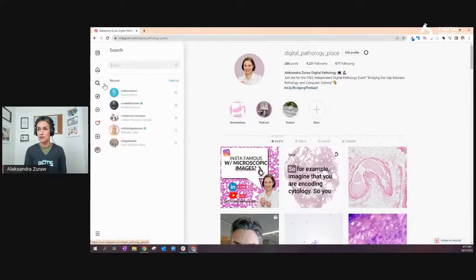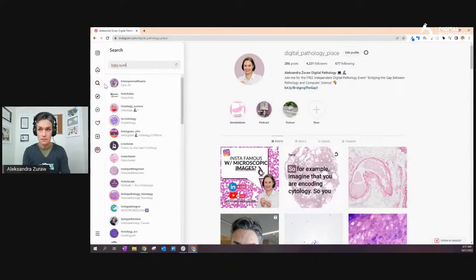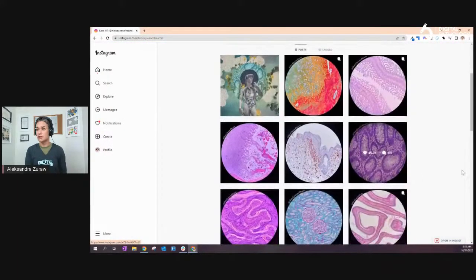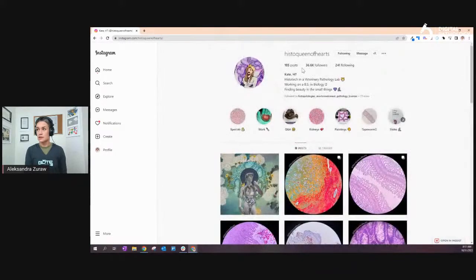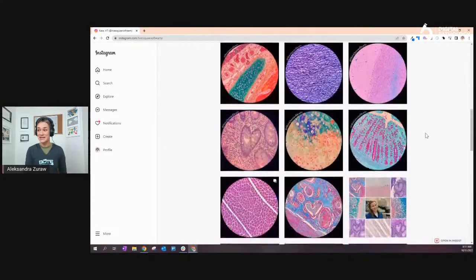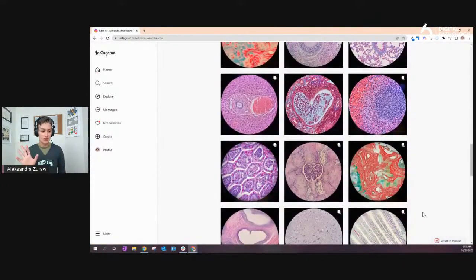And let's see if I can show you this other lady who is fantastic. And she doesn't use any equipment. She just uses her phone, I think an iPhone. Kate. She's working in a veterinary pathology lab. And look at this: 36.6K followers. She sure is Instafamous in the pathology world. So this is her style, and that's how she takes her pictures. Here I think she didn't do white balance. Here she did. But basically she just uses her phone.